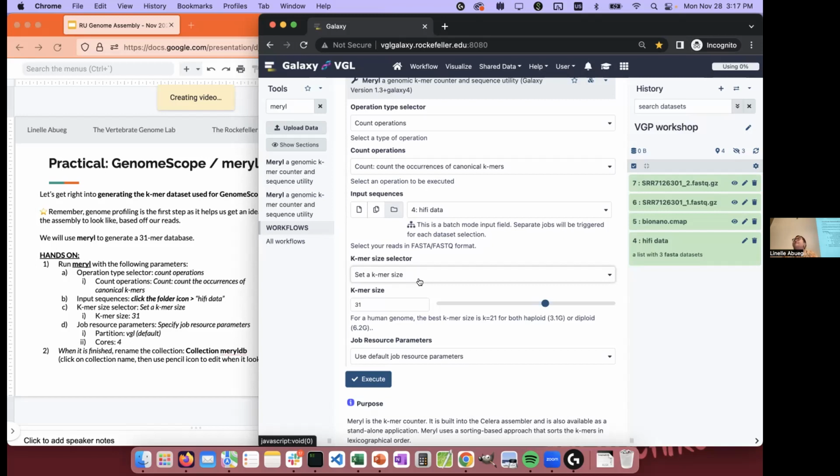One reason to choose the k-mer length really depends on the sequencing technology, particularly the sequence quality. Imagine that you have a lot of sequencing errors. Remember the Q10, which is one error every 10 bases, it means that no k-mers will really be real, no?